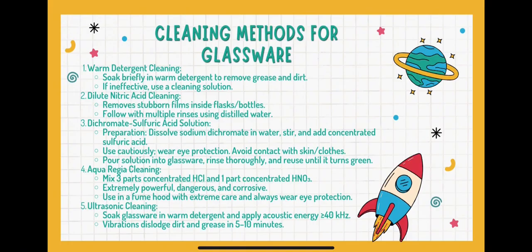Number 4 is aqua regia cleaning. This is the strongest cleaning method. Mix 3 parts hydrochloric acid with 1 part nitric acid. It's very dangerous, so only use it in a fume hood while wearing protective gear.